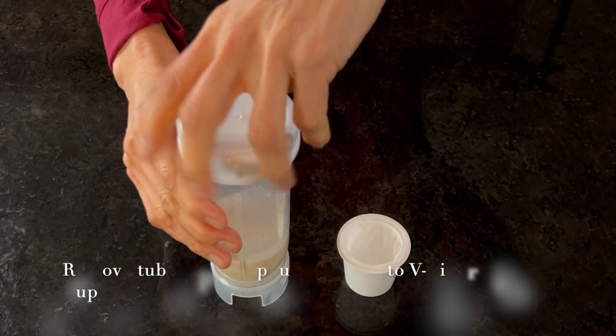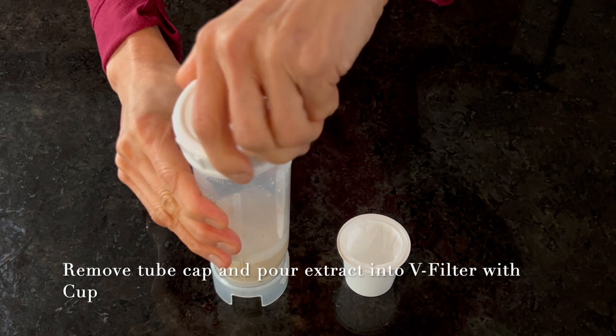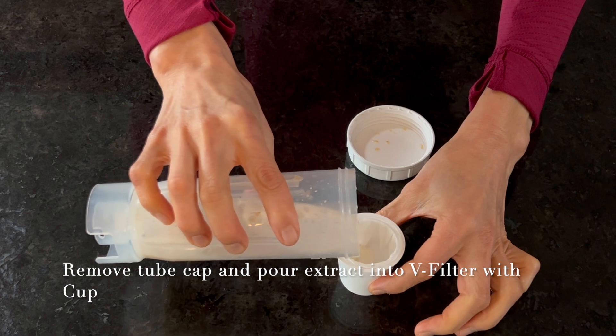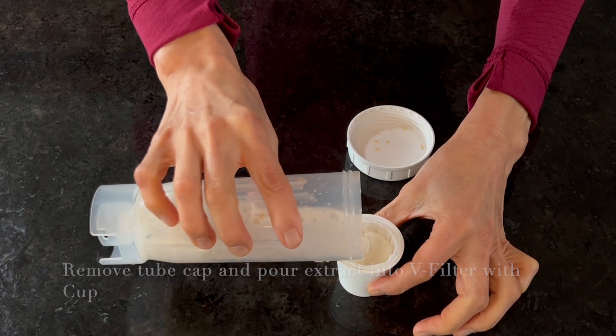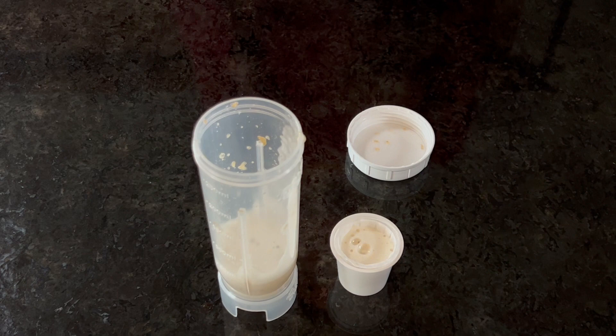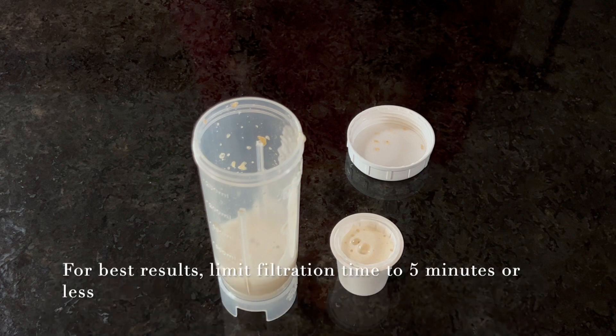Remove the cap of the extraction tube, pouring the blended sample directly into the V filter with cup, allowing filtration until a minimum of 100 microliters of filtered sample is available for next steps. For best results, limit filtration time to 5 minutes or less.